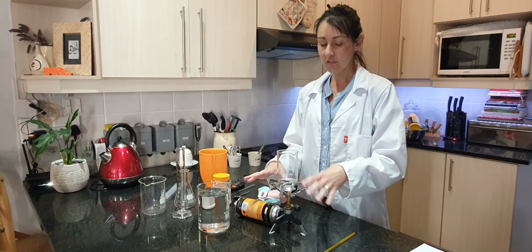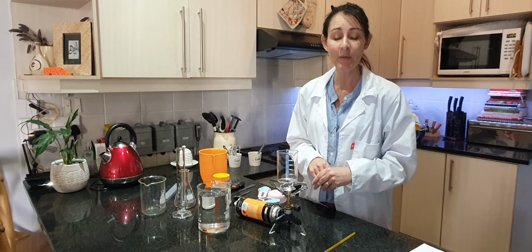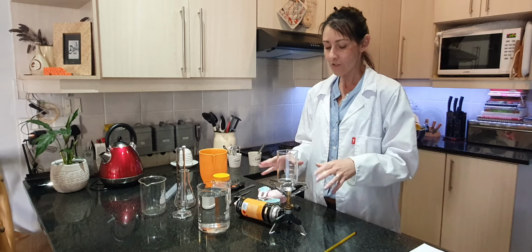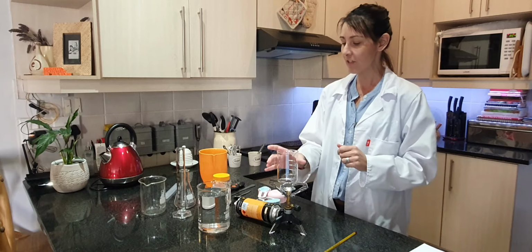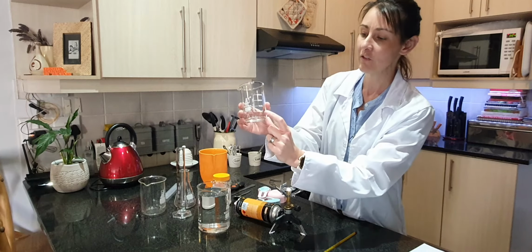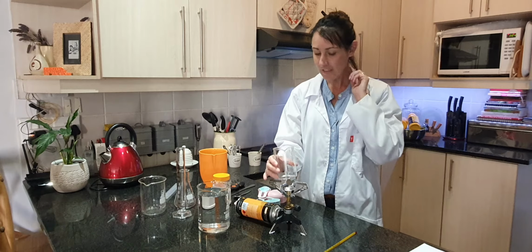I have a little gas burner here instead of a Bunsen burner. Under your requirements, it says Bunsen burner, gas stove, or a stove. So this is like a little camp stove that I'm going to use. It also says a measuring beaker. This is my measuring beaker, and you can see it's measured there in 50, 100, 150, and 200 milliliters.